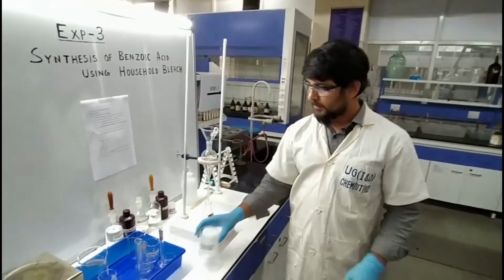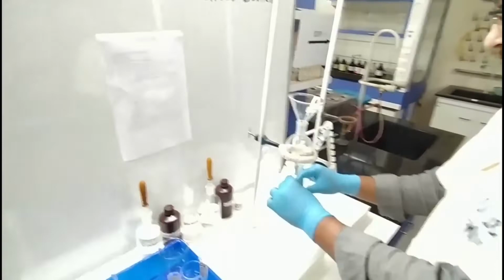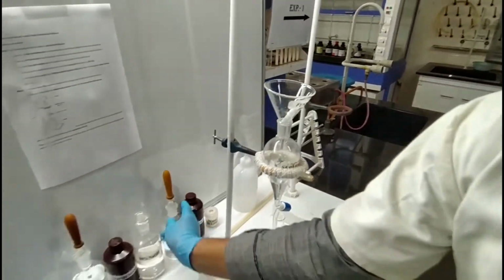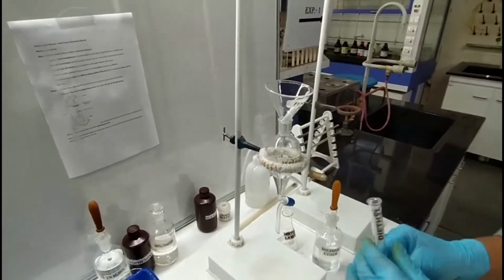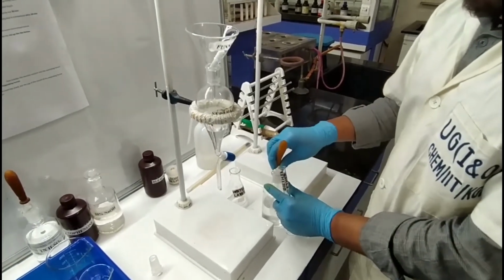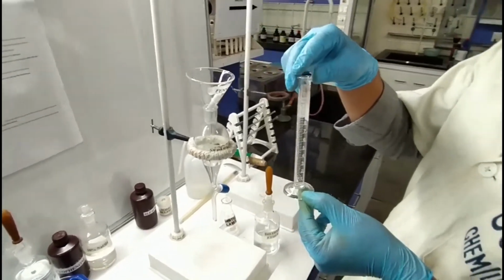Okay, 10 minutes completed. Now I am going to transfer the reaction mixture into the separating funnel. Now we have to add 10 ml diethyl ether over there. We can measure diethyl ether using this measuring cylinder, which can measure only 10 ml.